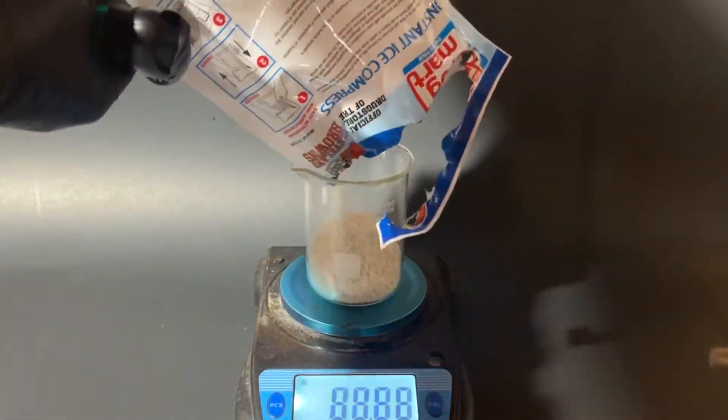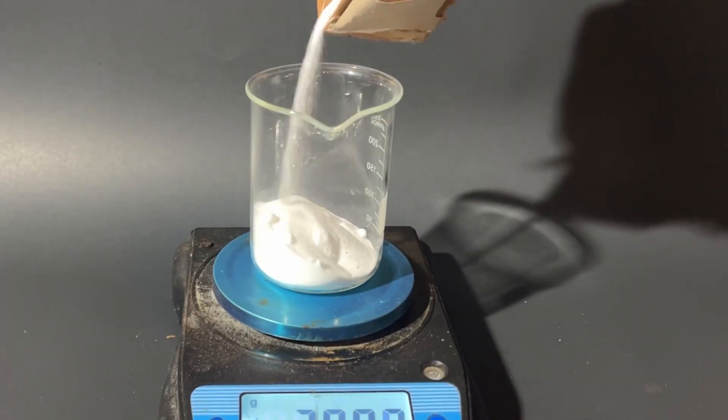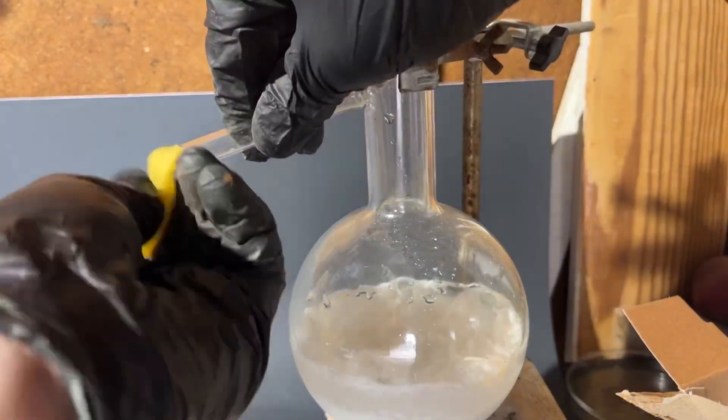First, I weigh out 80 grams of ammonium nitrate and another 80 grams of sodium bicarbonate. I add both of these chemicals into a round bottom flask, alongside about 120 milliliters of water, and I crank up the heat.